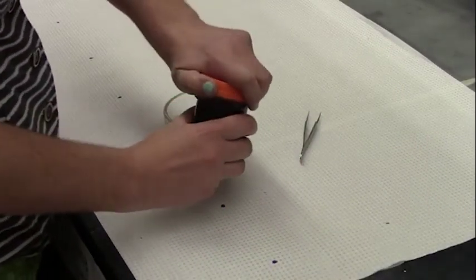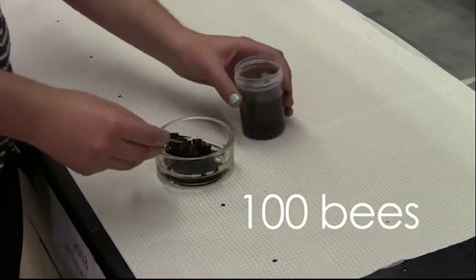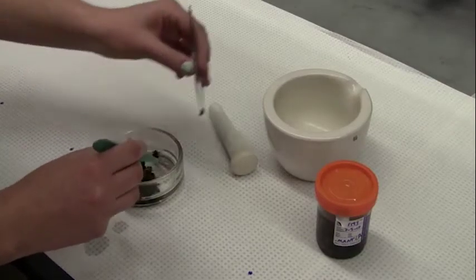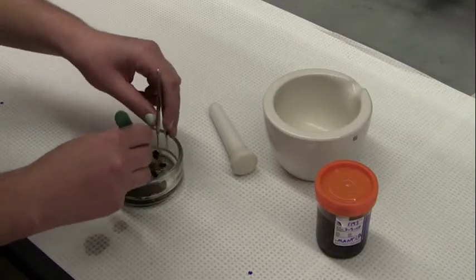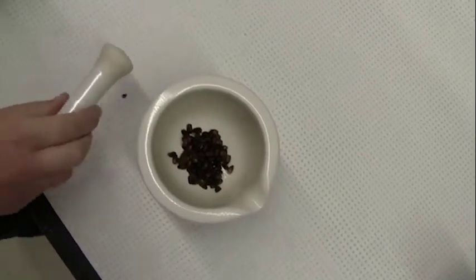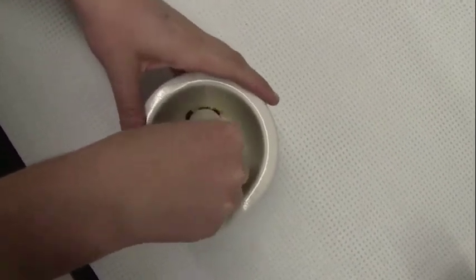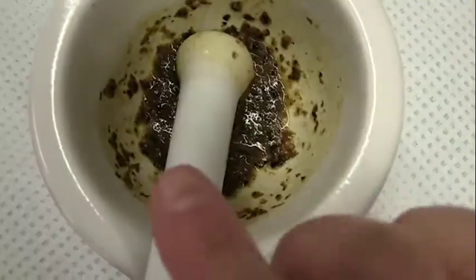From your sample, take out exactly 100 bees with forceps and place in your container. Sever the abdomen from the thorax of each bee using a cutting utensil and forceps. Place all abdomens into the mortar. Grind your 100 abdomens with the pestle. It's important that all abdomens have been thoroughly crushed for a homogenized sample.